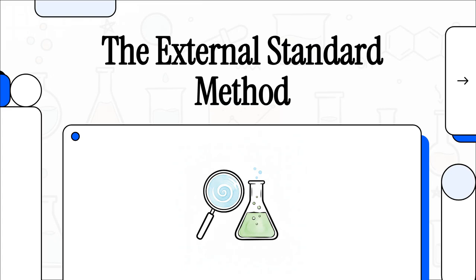Okay, let's dive right into this explainer, where we're going to unpack the fascinating and surprisingly elegant world of quantitative chemical analysis. I want you to imagine, just for a second, that you're a molecular detective. You're examining a sample, and you don't just need to know who is at the scene of the crime, you need to know exactly how many of them there are. That's the whole essence of what we're tackling today, the external standard method.